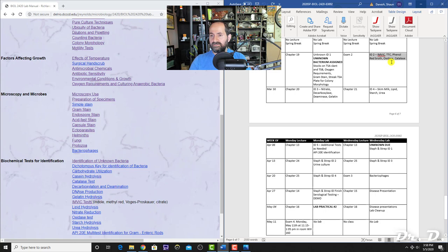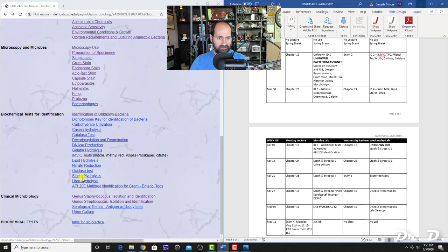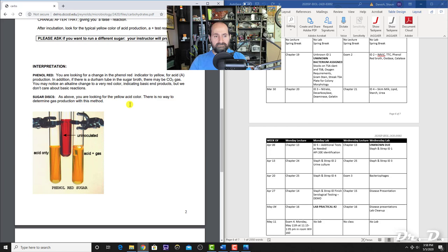The phenol red broth refers to the carbohydrate utilization tests. The carbohydrate broth starts out red because of the color indicator phenol red. If the bacteria can use the sugar mixed into the tube—say, glucose—they will cause an acidic pH change and the tube will turn yellow. Yellow after incubation means positive for that sugar use; red means the bacteria did not use the sugar.